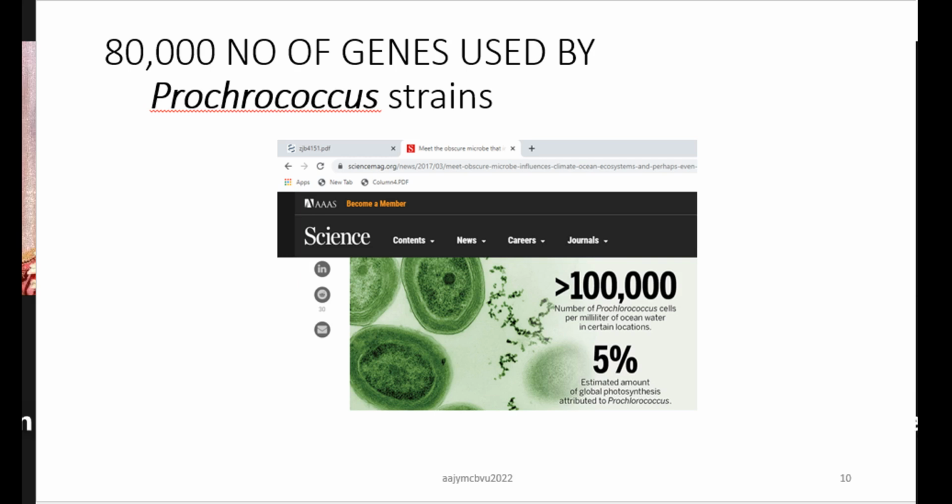All right. Now, going beyond these designs, we have to talk about the microbial interactions which are going to be helpful for each other's growth, right? So, when you talk about a diffusion chamber, for example, incubated for 1 to 4 weeks, you are going to get the isolated colonies. Diffusion chambers have been used for diverse environments, maybe sediments, soil, or marine sponges, the flora associated with marine sponges, and have been found to be highly efficient in terms of microbial recovery.